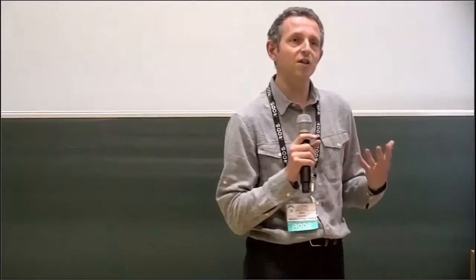But the amount of data that's going to be generated from the Prometheans was going to be higher than that, so we wanted to do this directly and take it straight off the instrument and straight into iRODS. And this seemed a good idea because the Prometheans under the hood are Unix machines that you've got access to. And so we thought we could do something like that. And when I say we, it's my colleagues who have been doing this.